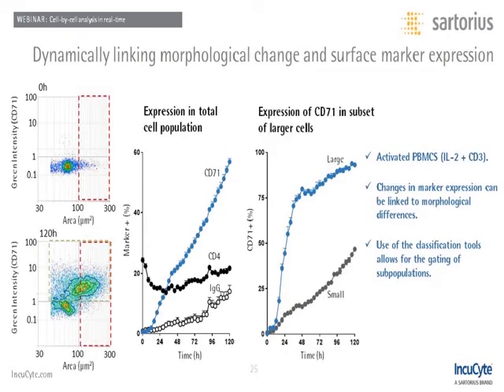Now we can return to what was previously discussed in regards to the heterogeneity of activated PBMCs and focus on further analysis using both morphology and fluorescence.